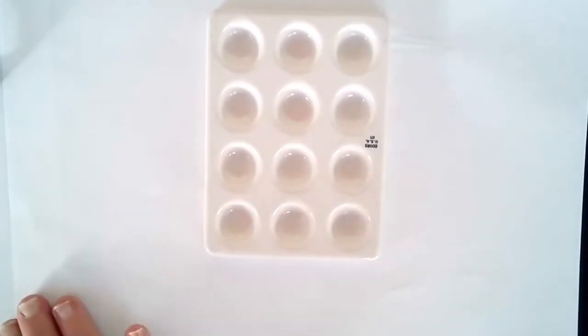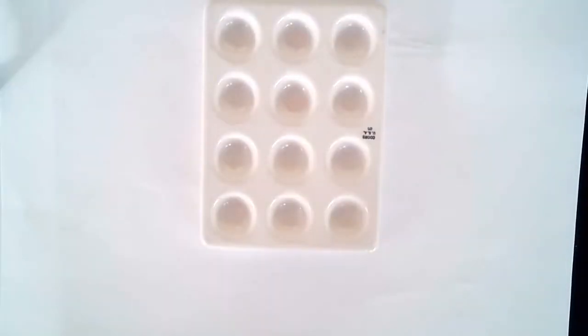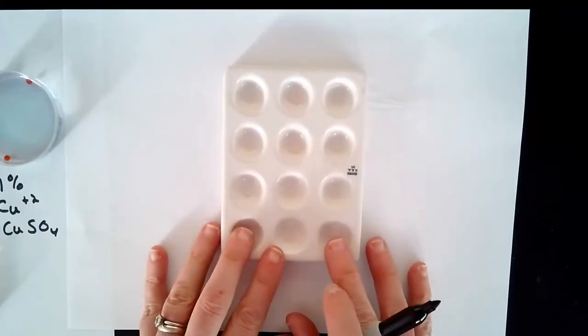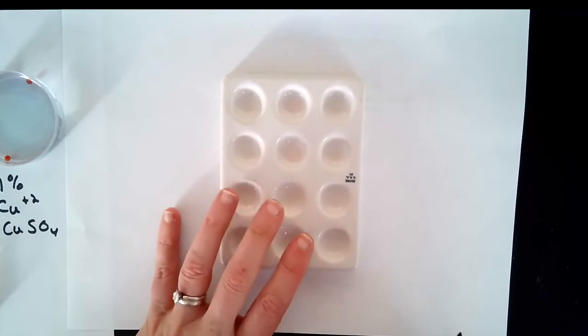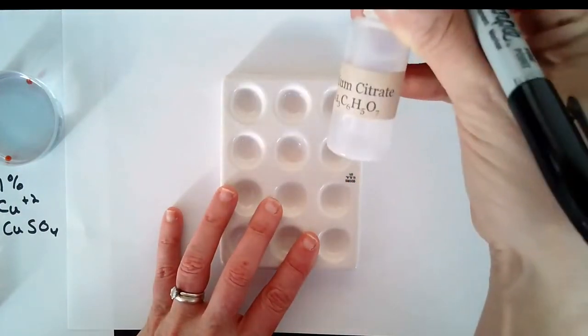So to label the spot plate, you need to indicate where you are putting the beads, what they were made from, and then how you are going to treat them, either with the sodium citrate or with a control solution.